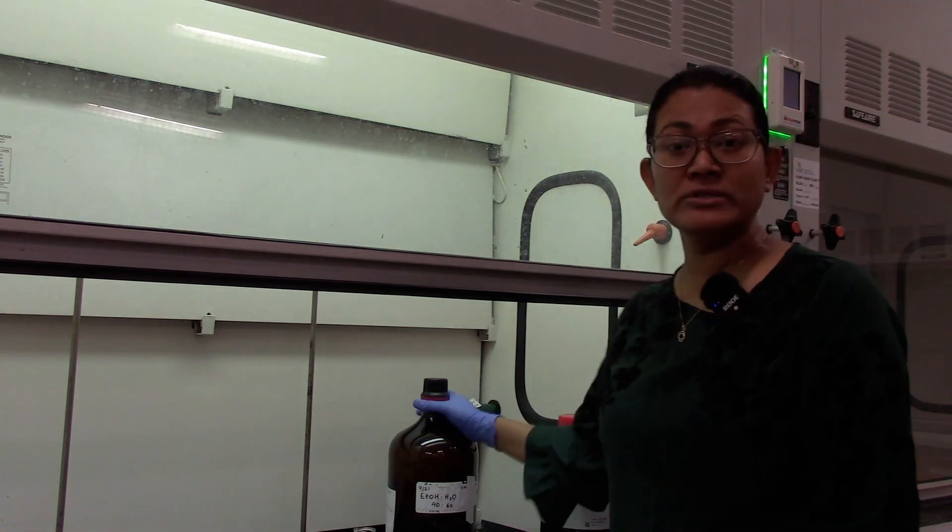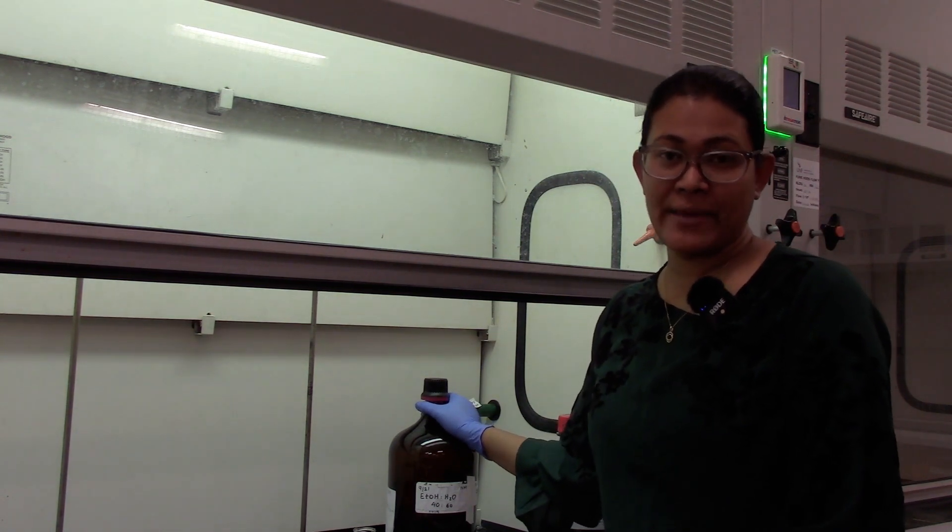Hello everyone. Today we are working on fractional distillation and we are going to use a mixture of water and ethanol.